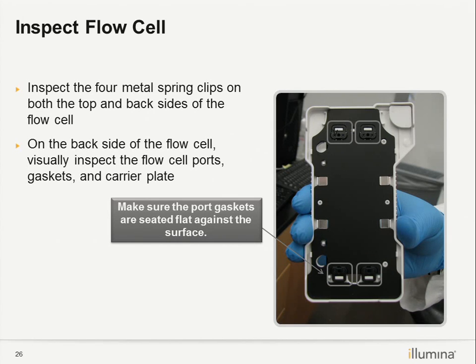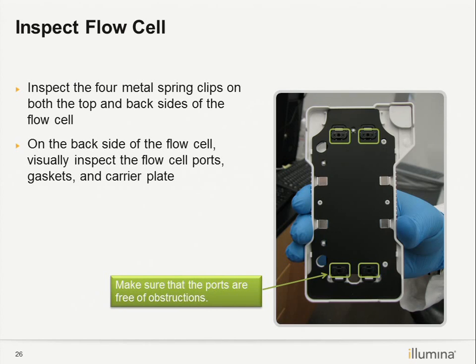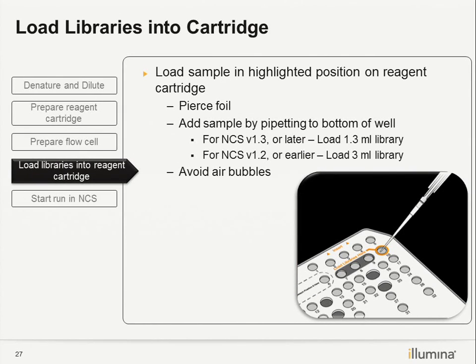And you can also check that this white plastic is in place. If there is one that has a different level, then you probably want to manually clip the flow cell to ensure that they're in place. Okay, this is the gasket. And then you just load the libraries.